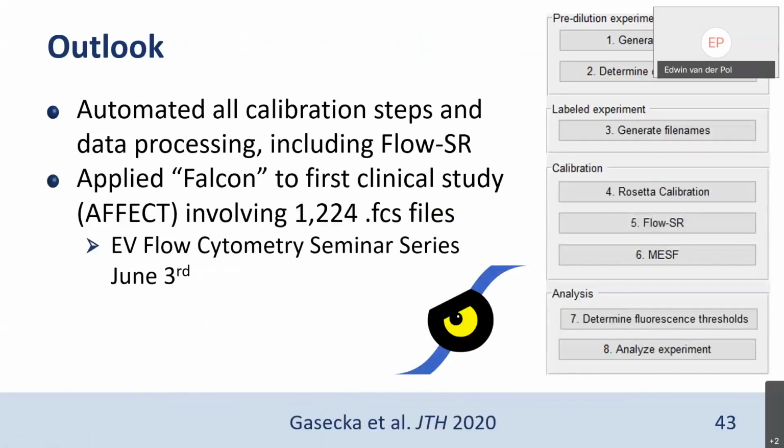As an outlook, yeah, we automated this process. We automated all calibration steps, which we now do, including flow SR, with a software package which we named Falcon. It consists of only 8 buttons to make it as simple as possible. And we applied this in the first clinical study, which is named AFFECT, involving 1,224 FCS files. So obviously you don't want to manually process all those files by flow SR. I'm not going to talk about this. It's the topic of the next immediate flow cytometry seminar series.